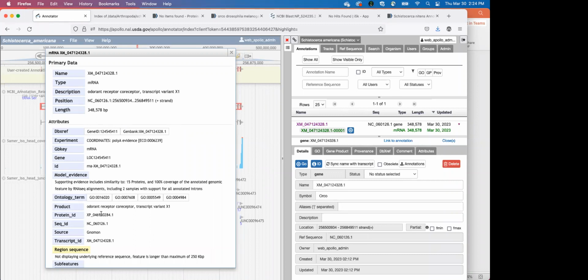But that's also the problem with Drosophila, because obviously the functions can be quite different. That's what I talk about as translation error. You have to be careful. It's one of the problems with KEGG and other things when it assigns functions, right? It'll tell you it's important in gill formation. Well, that's nice. My species doesn't have gills, right? So you really have to be careful with what the process was and what evidence was available, how much similarity was used to transfer that knowledge, or that annotation, to your species.